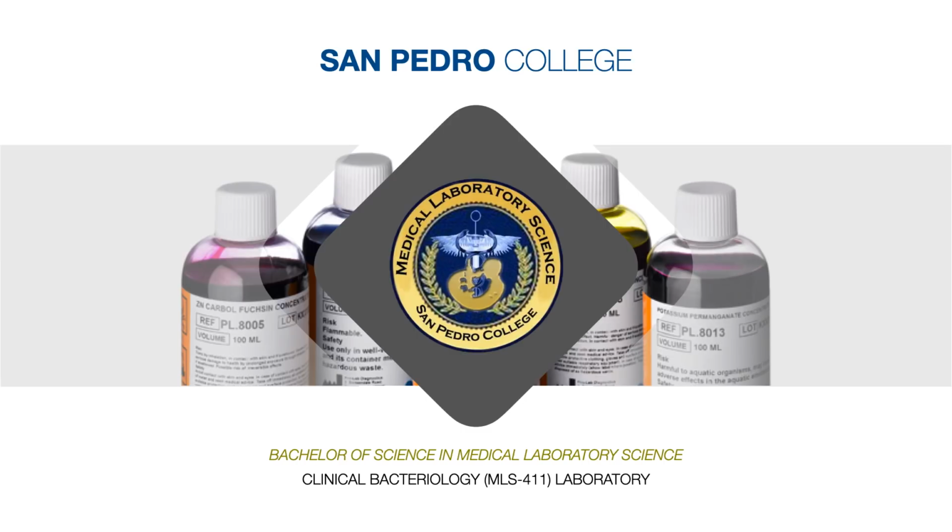We also tackled the different structures that just a certain type of bacteria possess, the unique structures that would help you further identify a bacteria, and also the procedures you need to master in order for us to really demonstrate these bacteria and their structures.